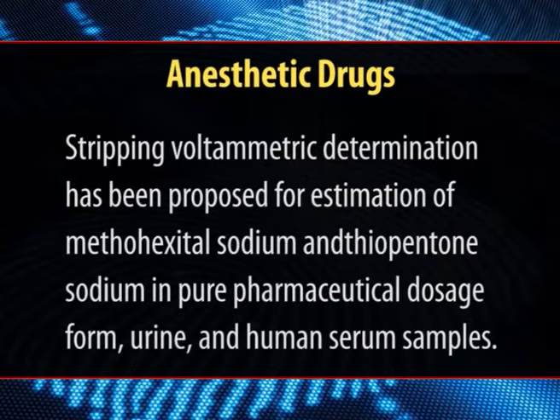Cyclic voltammetry, direct current polarography, differential pulse polarography and alternating current polarography have been used to study the voltammetric behavior of Ramipril, which is used for the treatment of hypertension, especially in persons with heart problems. The next in this category is anesthetic drugs.